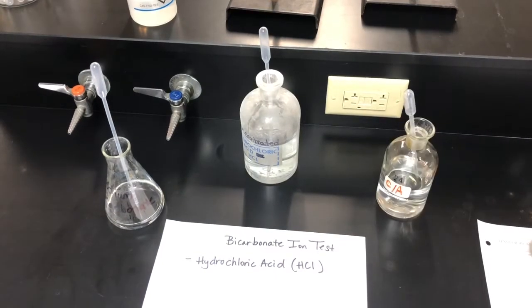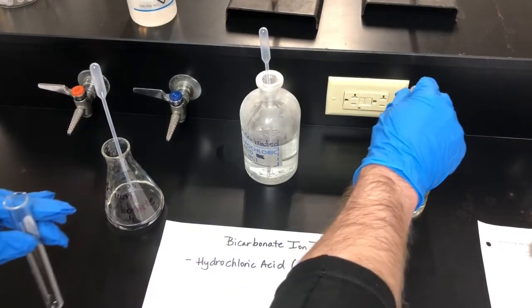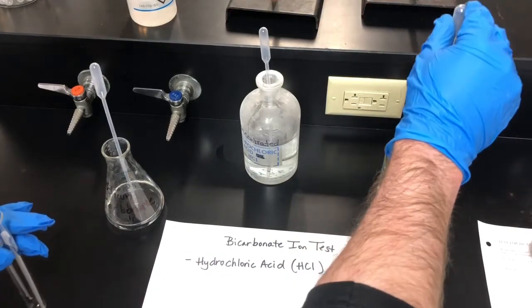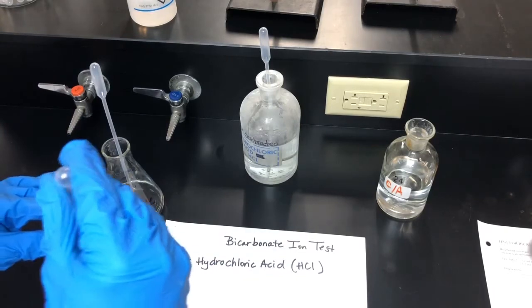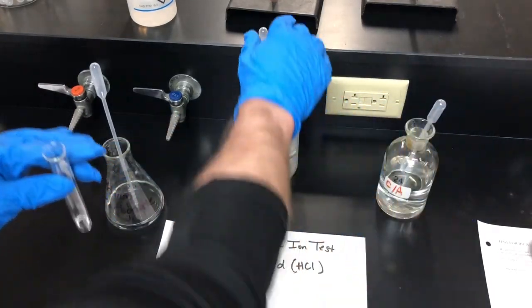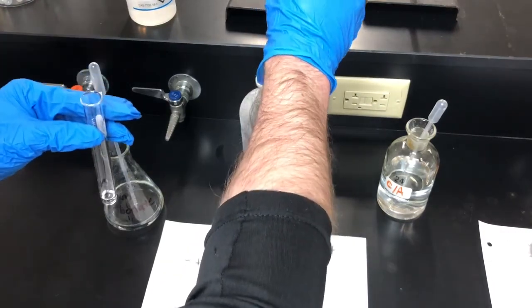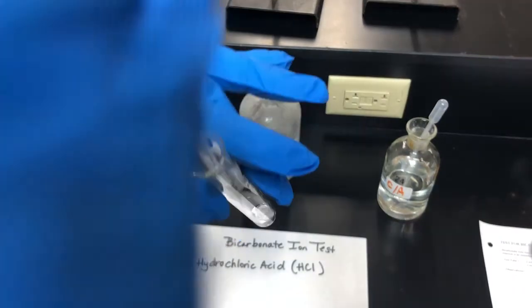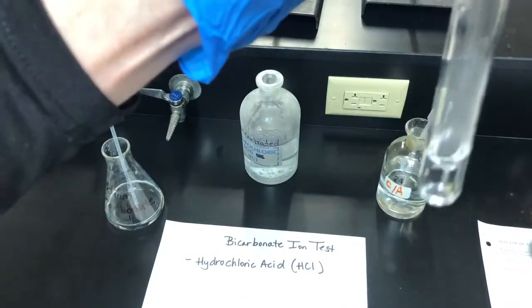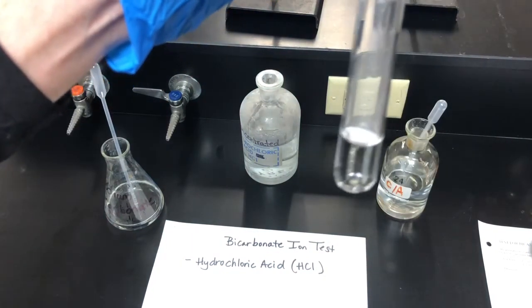Still doing unknown number 24. We're going to do the bicarbonate ion test for this. Okay, so I'm going to take a squirt of my unknown, and I'm going to take a squirt of hydrochloric acid. Okay, so I'll try and make sure we get close to the camera so we can actually see the fizzing going on. Okay, so it fizzed. So I would say that it is positive for the bicarbonate ion.